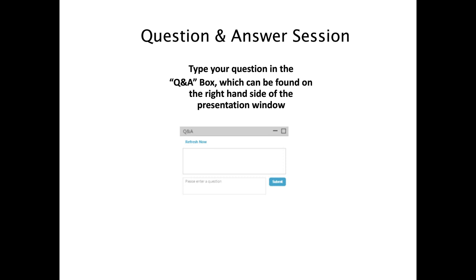Our next question is, I thought that methanol was the preferred organic modifier with both phenyl and PFP phases. Should I even bother trying acetonitrile? I think I mentioned that during the presentation, but yeah, you really can't tell.